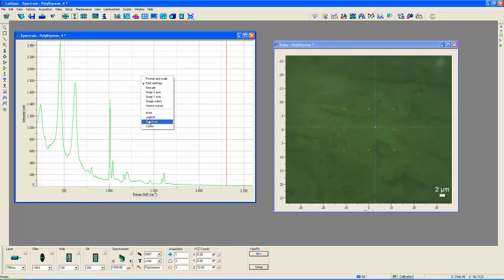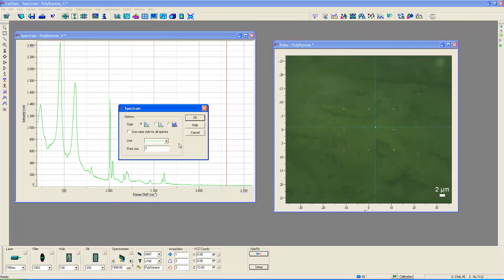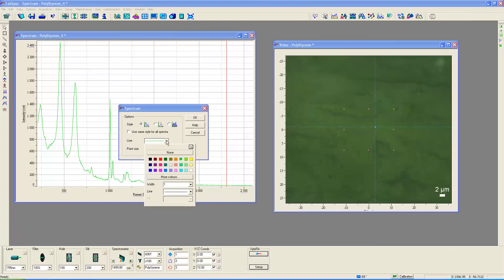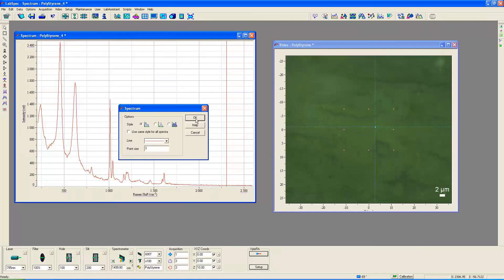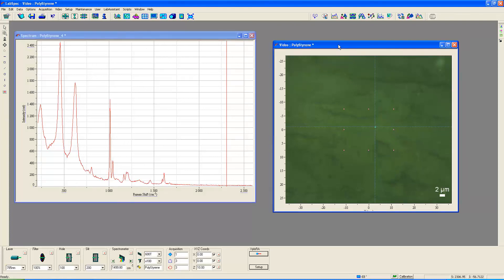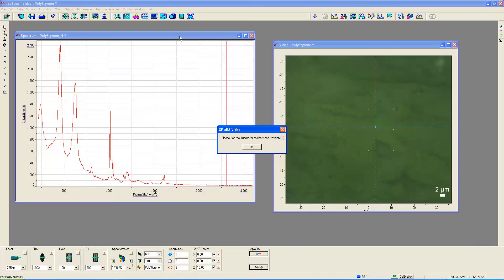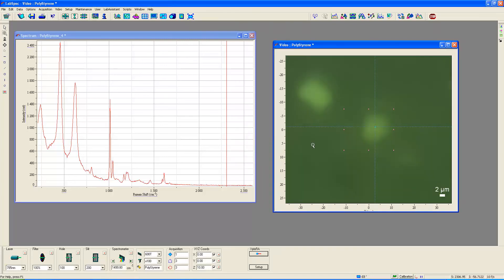And as I said before, I don't really much care for this color. The contrast isn't so great. It'd be easier for you to see if we make this red. The first one is blue. Now, let's go back to our video. And we click the video. And the instructions tell us to move the turret to position 2, which I do.